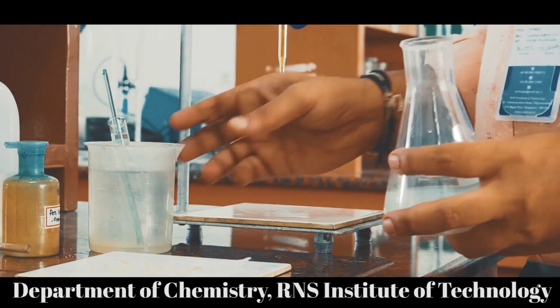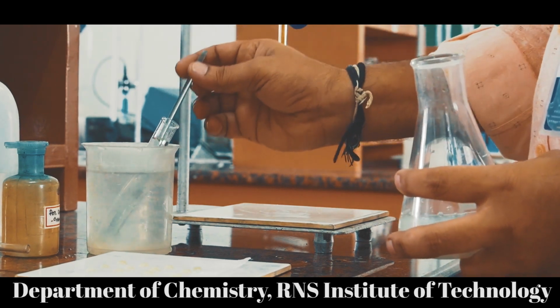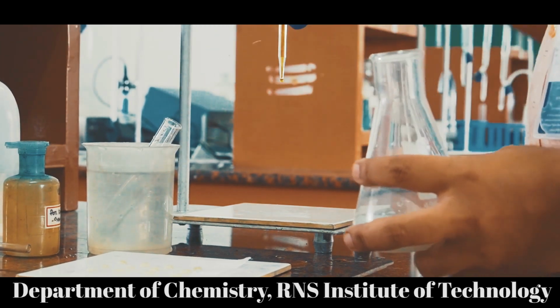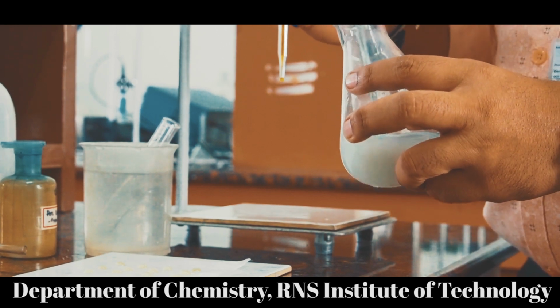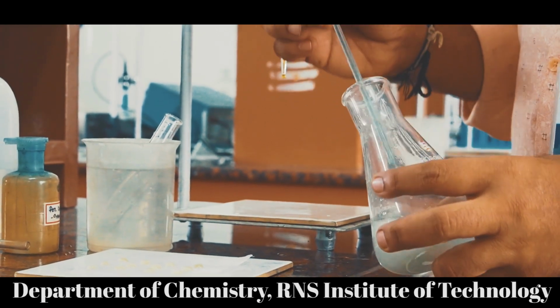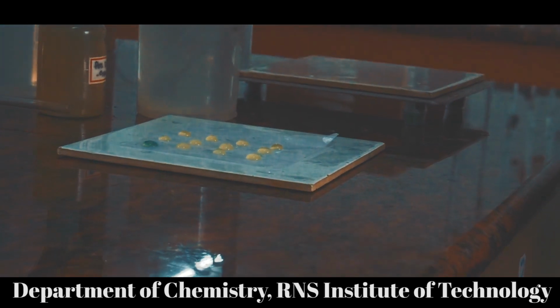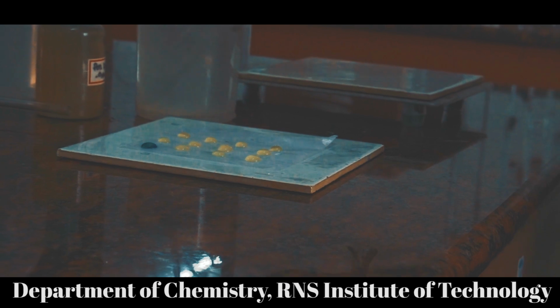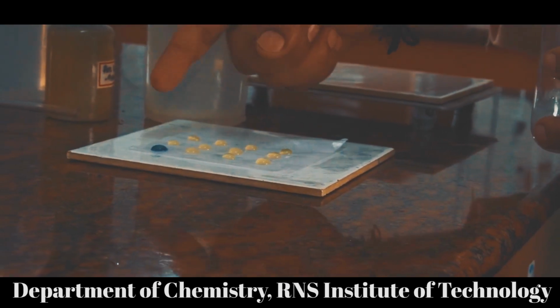The way of checking is, you have to take the glass rod and dip it in the test tube which is taken with the distilled water. Dip this glass rod into the reaction mixture and bring a drop of reaction mixture in contact with the first droplet of the indicator, just like this. So we are going to get a blue color. The indicator color will change into blue.